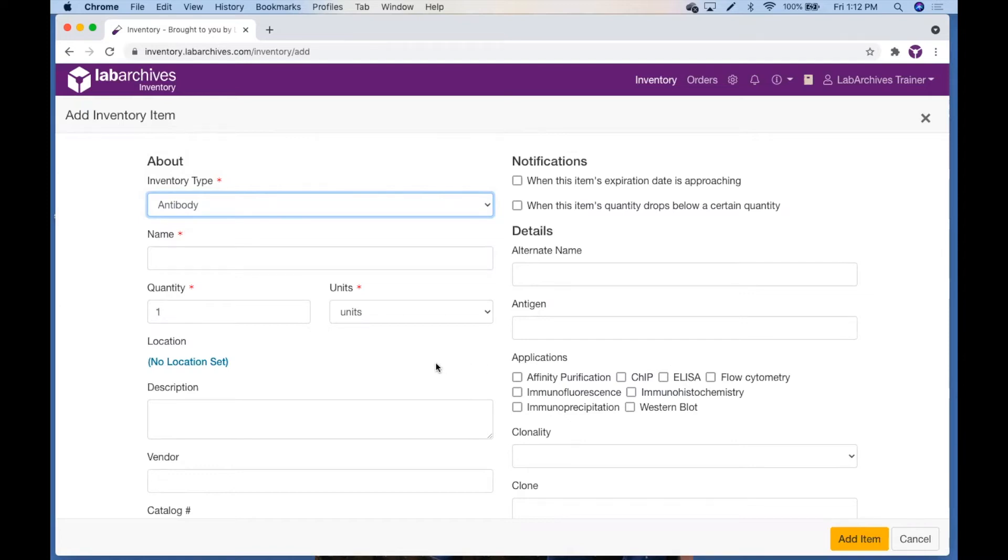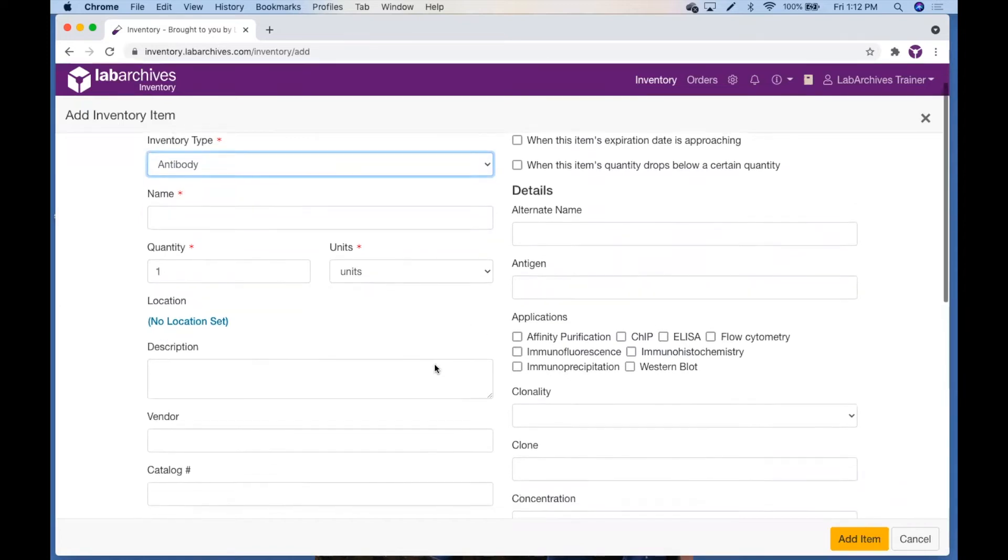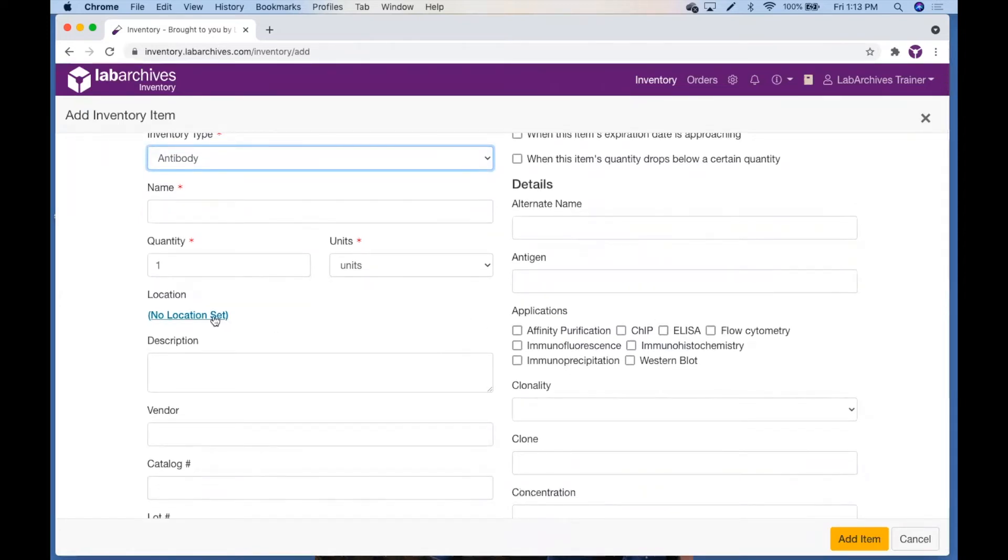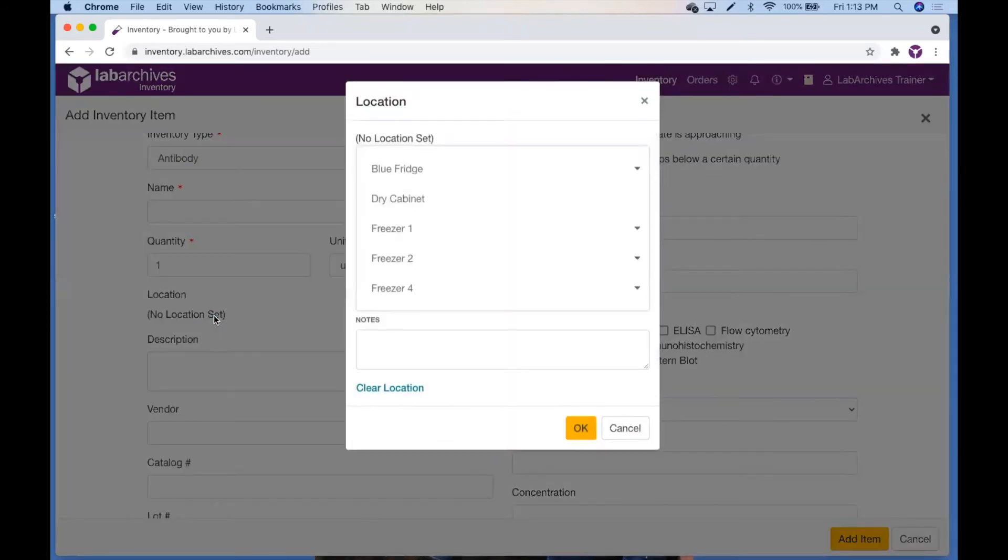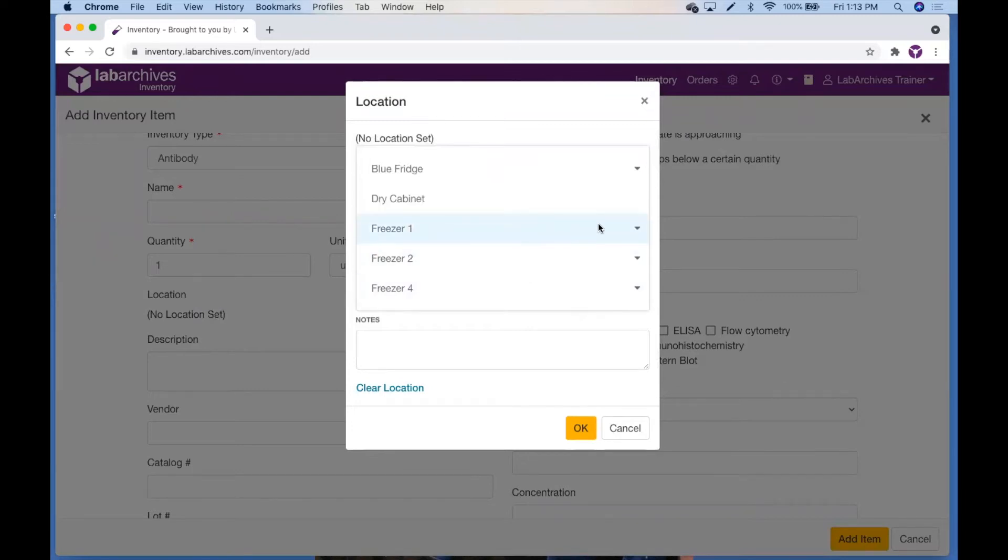To specify a location for this item, click the No Location Set link. This will open up the locations that have been set up for your lab. Select a location or a sub-location.